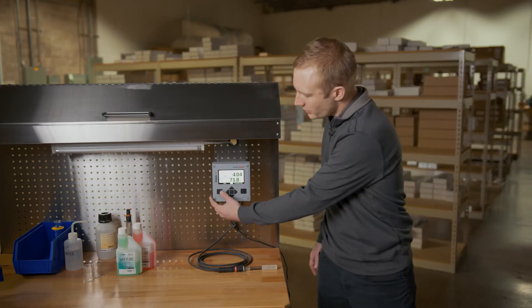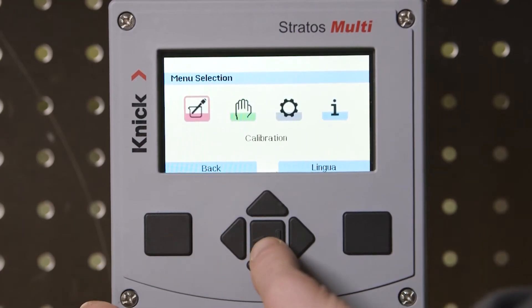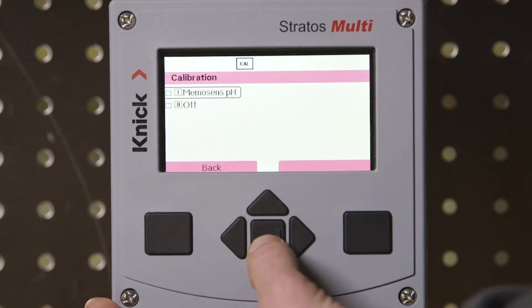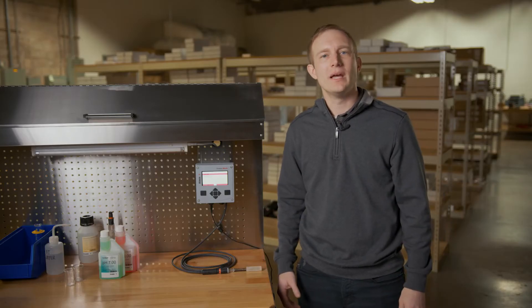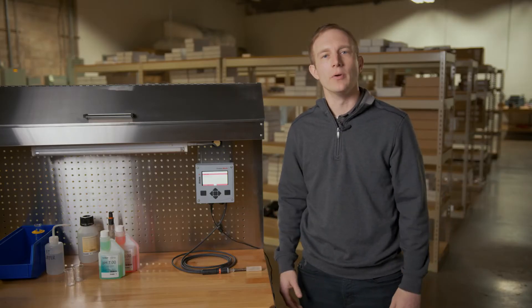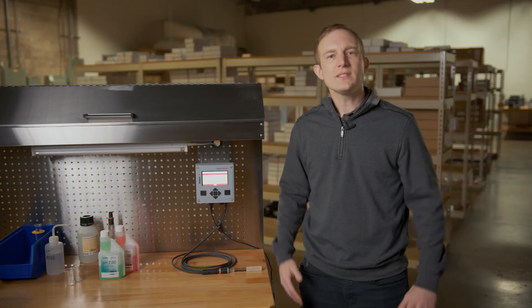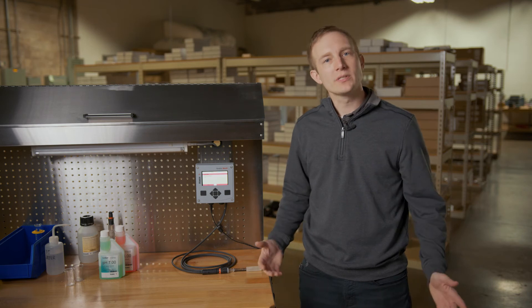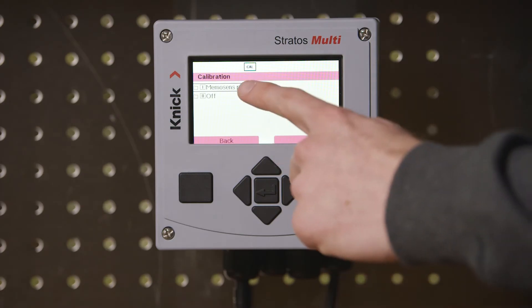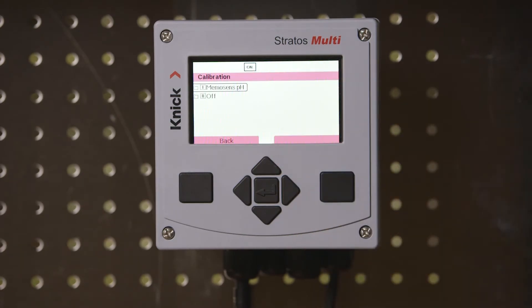Let's begin by pressing menu on the main screen and then enter on calibration. If access to the calibration menu is blocked via a passcode please note that the default is 1147. Once inside the calibration menu we will select the MemoSense pH sensor that is connected to channel one of our transmitter.